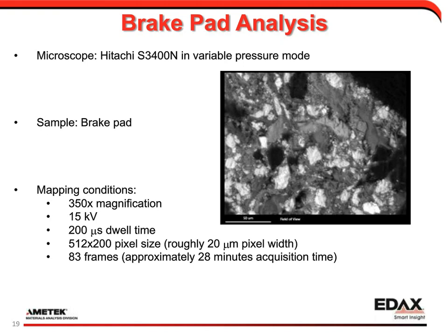Basically, if we're looking at silicon, the silicon K line is at 1.74 keV, and the absorption edge is slightly above that. So in general, if we have anything less than 3 keV coming down, the silicon K line will be so poorly excited we won't get much of a signal. And as you go down in acceleration voltage, you lose more and more elements that you basically can't excite. You won't have good enough signal or statistics to do analysis on them.